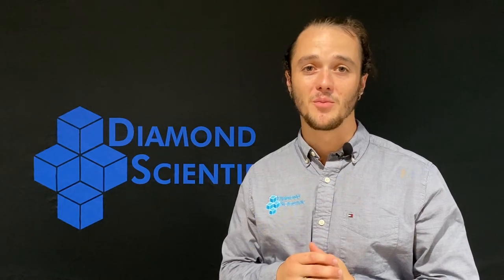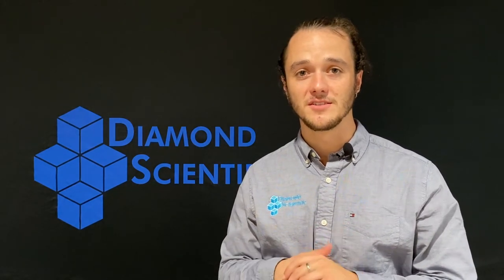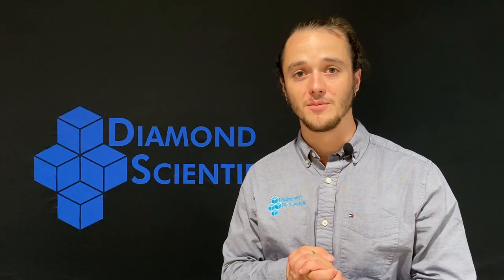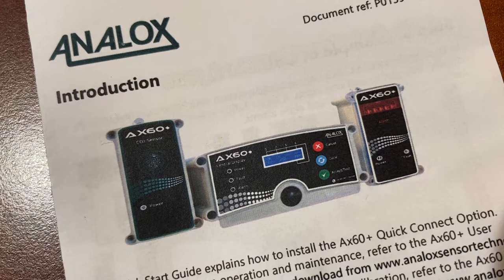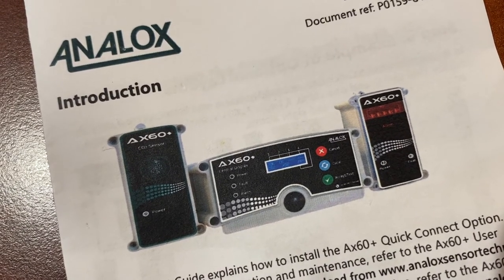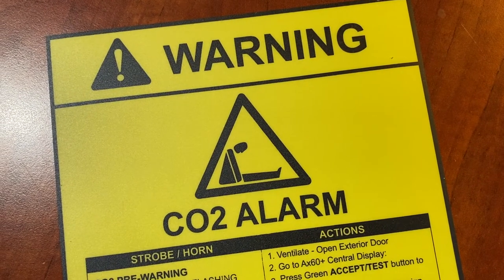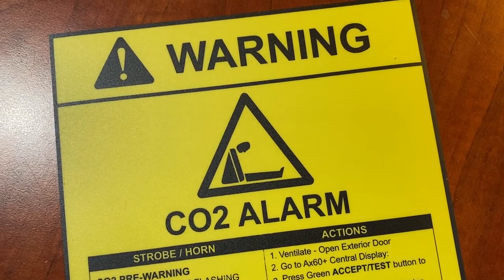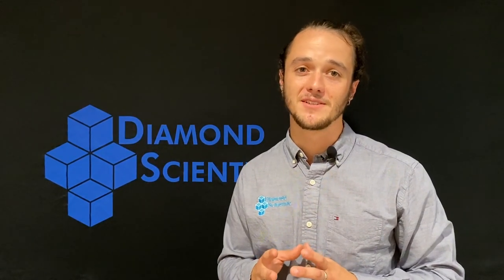The AX60 Plus system also allows for the incorporation of oxygen sensors. These systems can handle four sensors with eight corresponding alarm units total. The AX60 Plus systems come with a five-year warranty for both electronics and each sensor. While these systems come pre-programmed per local regulations, the user can adjust each alarm set point once received.